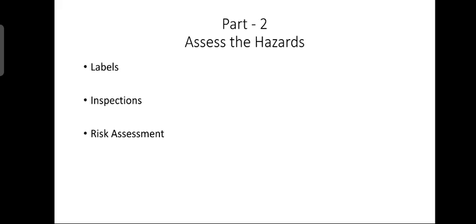Identify the occupational exposure limits, that is OELs, using TLV. What do you mean by TLV? Threshold Limit Value. And PEL. What is PEL? Permissible Exposure Limit values. Differentiate between flash point and auto ignition temperature. Define and explain the relevance of upper and lower explosion limits for a substance.